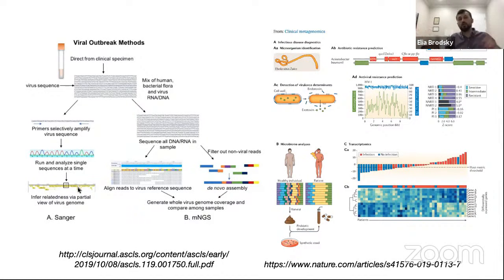Let's take one group of viruses, a family of viruses like coronaviruses, and we can start asking the question, how is the data that we have in this type of sequencing different from a reference genome of that particular family or a member, a species of those viral families. Now, we can also look at all of the data that is available.